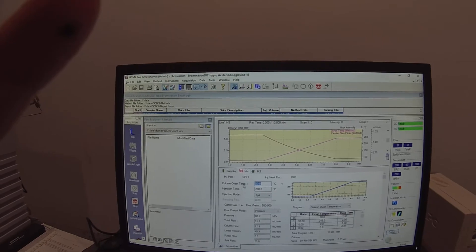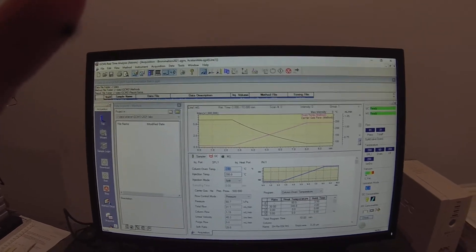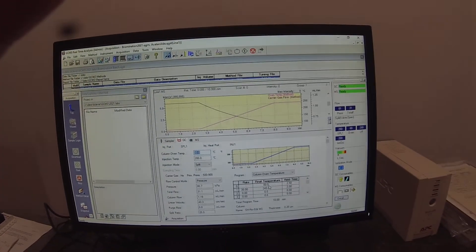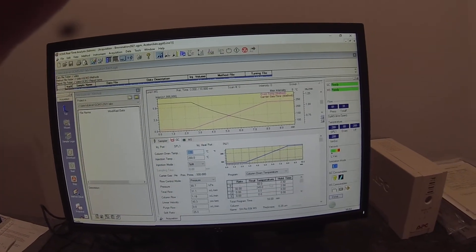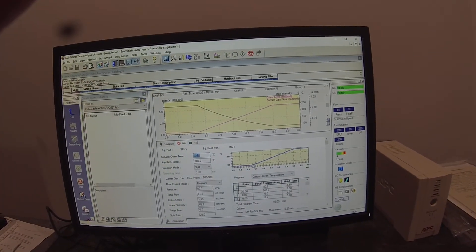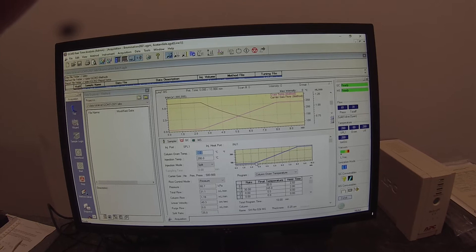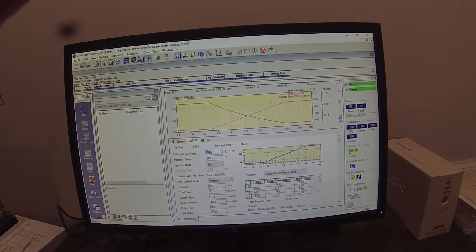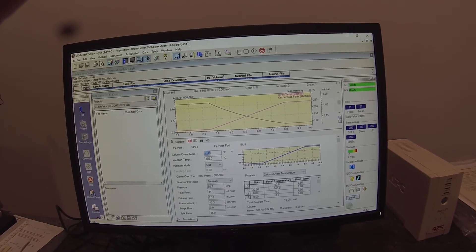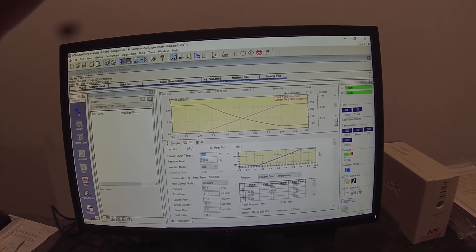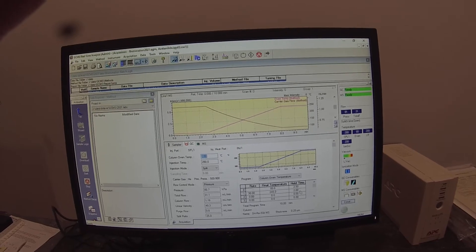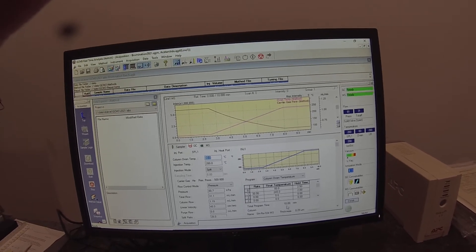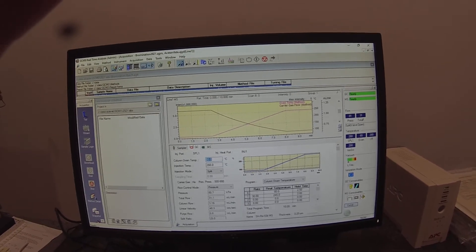Under GC you'll see the initial column oven temperature is 80 and we're going to hold for two and a half minutes at 80 and then rise fairly rapidly at 30 degrees C per minute until we hit 245 and then hold for two minutes. So this is a 10 minute run.